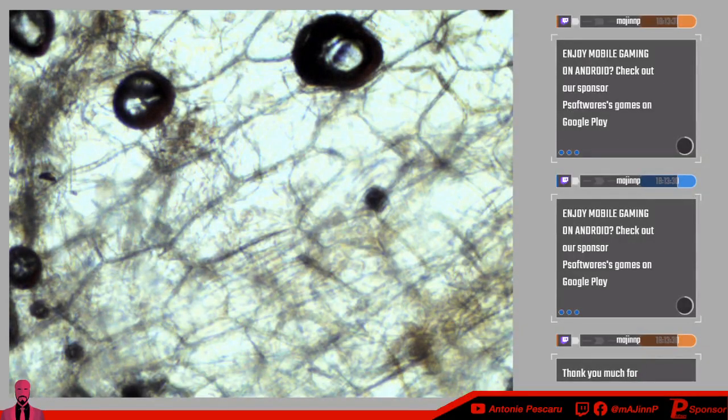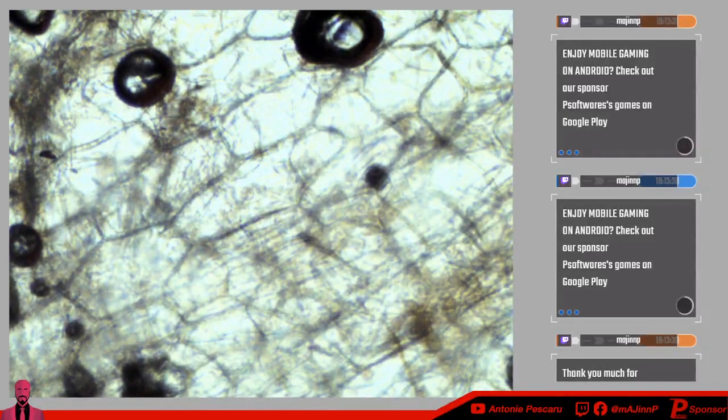That's a cell. Why? Because you can easily recognize it from the cell wall, and that's a huge difference between an animal cell and a plant cell. Now, I don't really see a nucleus here. I'm currently at 4x of optics or whatever it's called. Let me know in the comments what it's actually called, because I call it lenses, optic lenses.